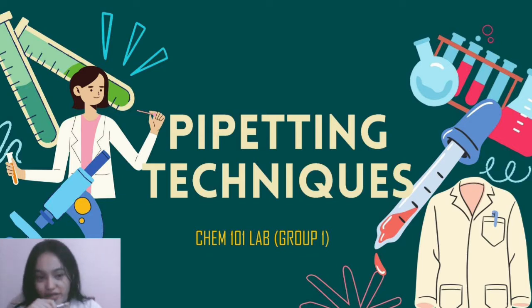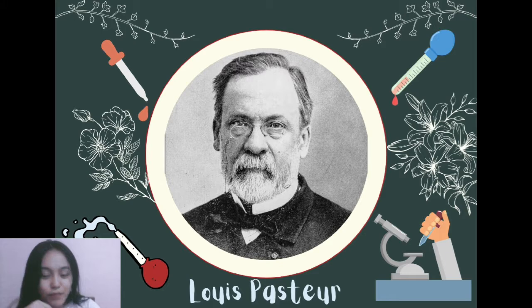So let's get started, but before anything else, how did the pipette develop? Louis Pasteur needed a method to keep things clean and sterile during research. As a result, he developed glass pipettes, today known as Pasteur pipettes.